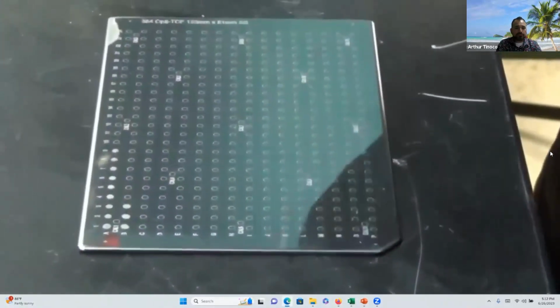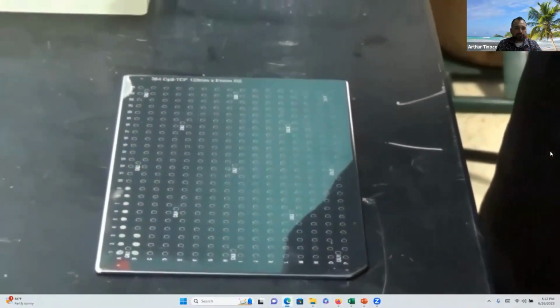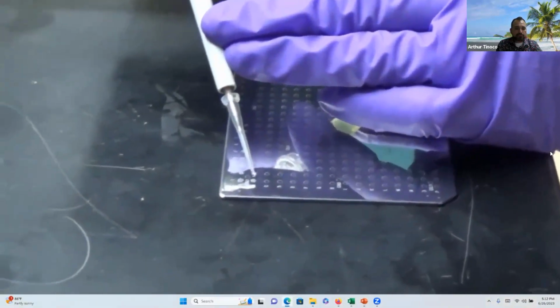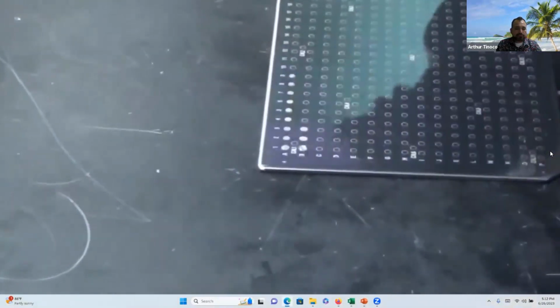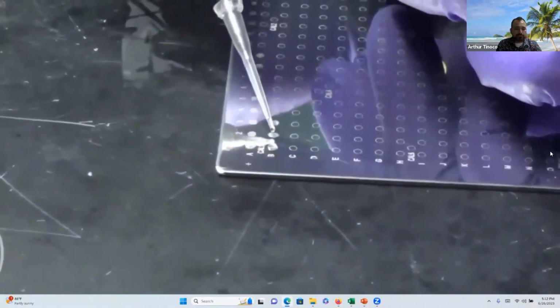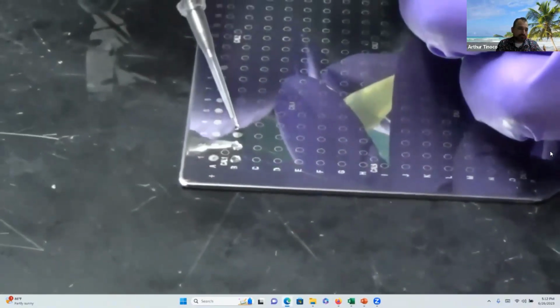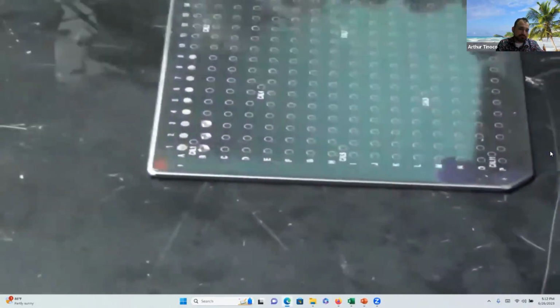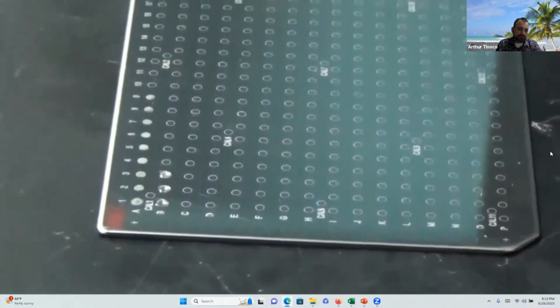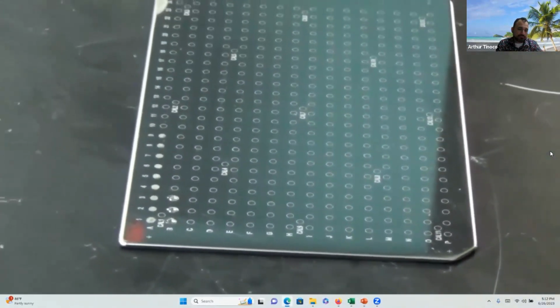One can take another approach if the sample does not dissolve in a solvent compatible with the solvent used to create the matrix solution. What I do then is spot the MALDI well with the matrix and let those spots crystallize. After they crystallize, I then spot 1 microliter of the sample solution on top, so that the sample will crystallize on top of the matrix.